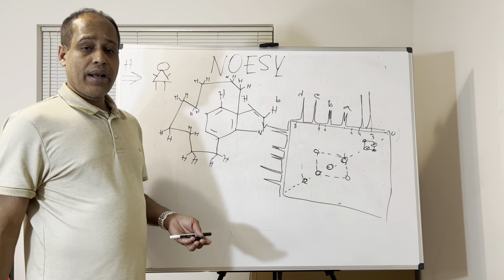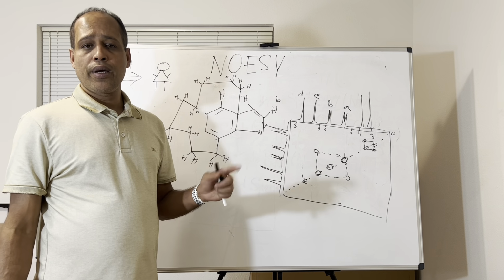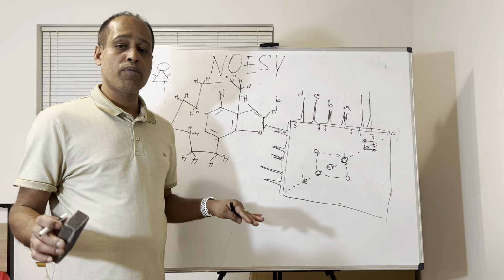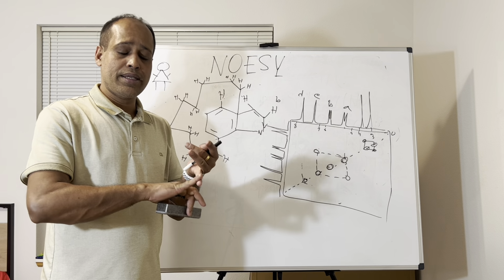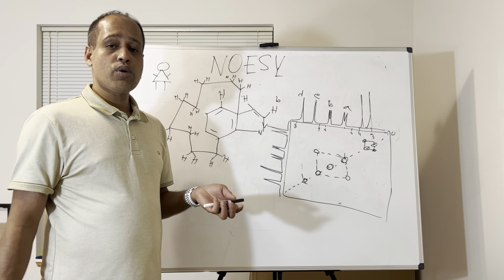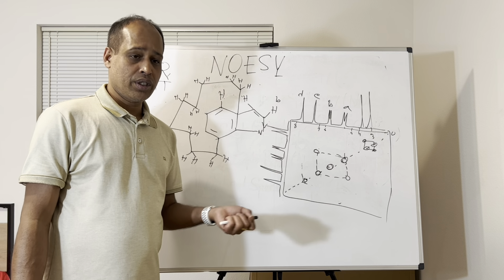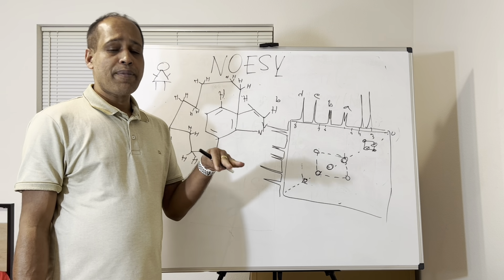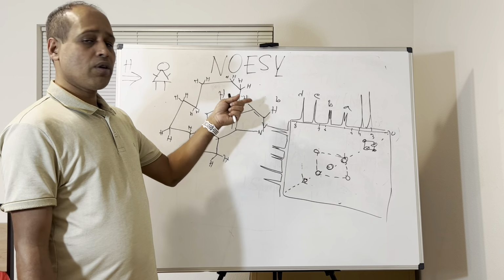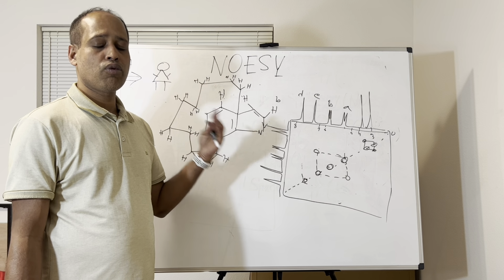So definitely in structure elucidation, only COSY or only NOESY cannot determine your structure. You have to check all of those things: COSY, NOESY, HMBC, HSQC, sometimes even DOSY. And you also have to check DEPT 90 and DEPT 135 to determine the types of carbon and proton. Using all those tools together, you can identify the full correct structure.